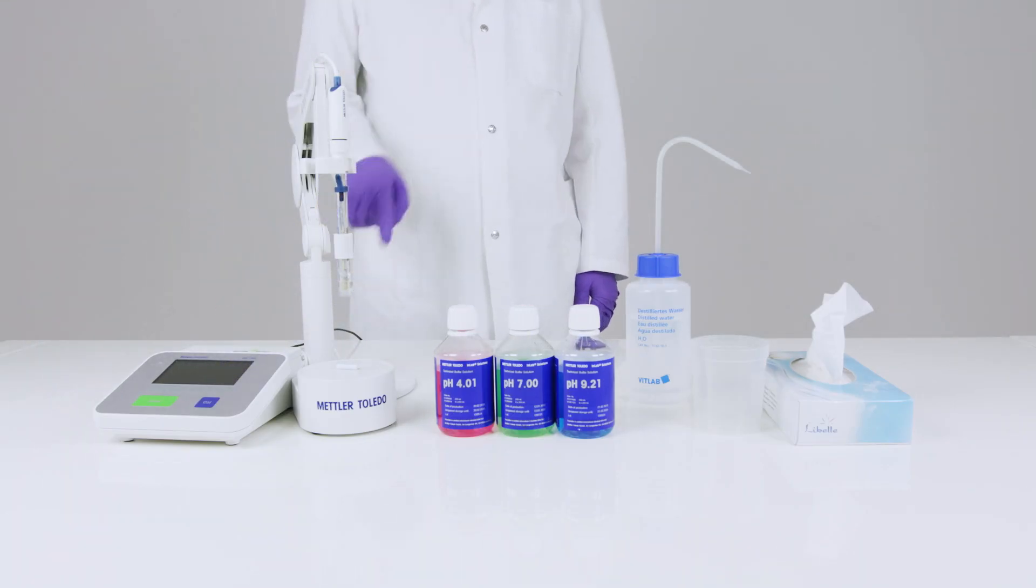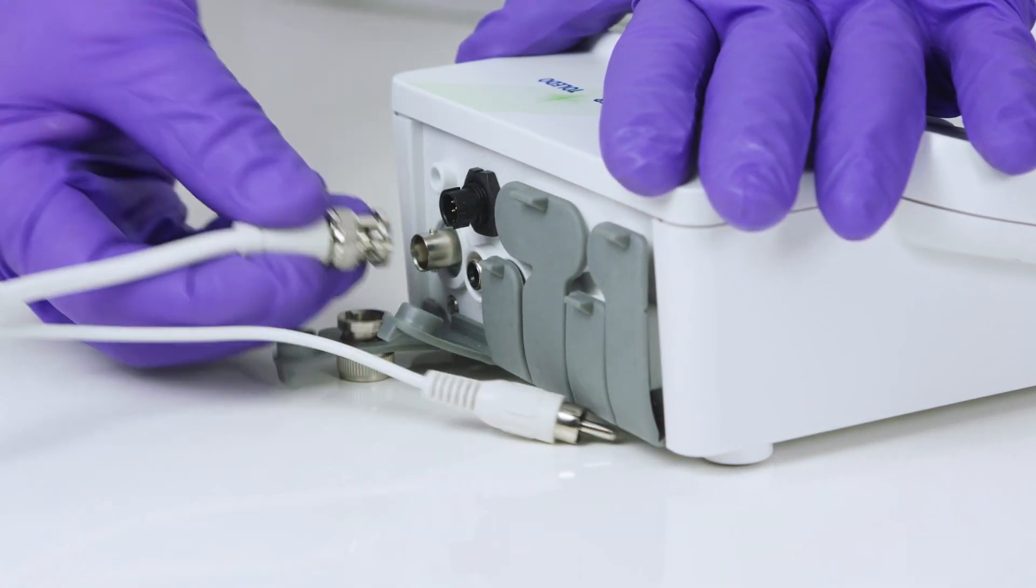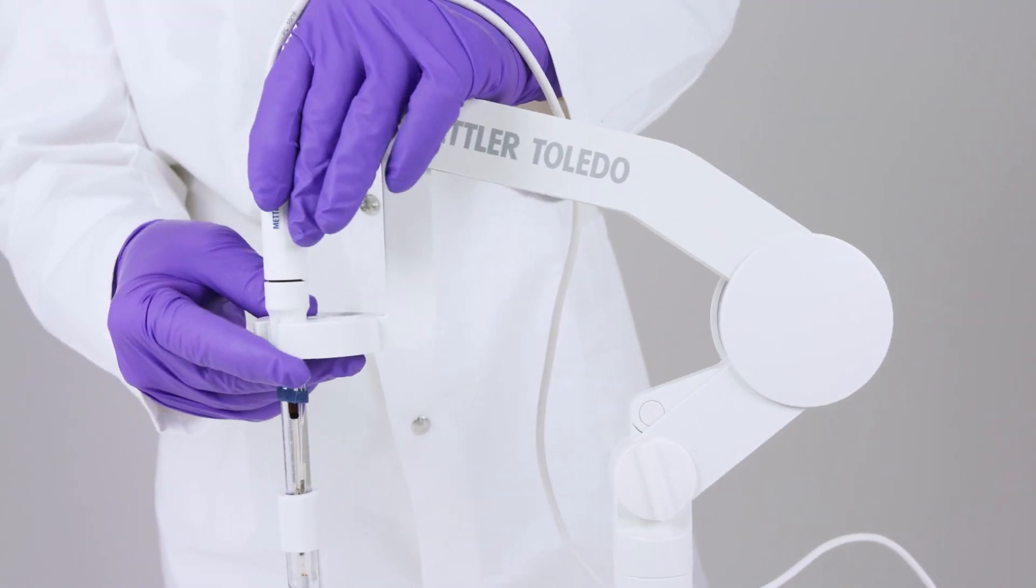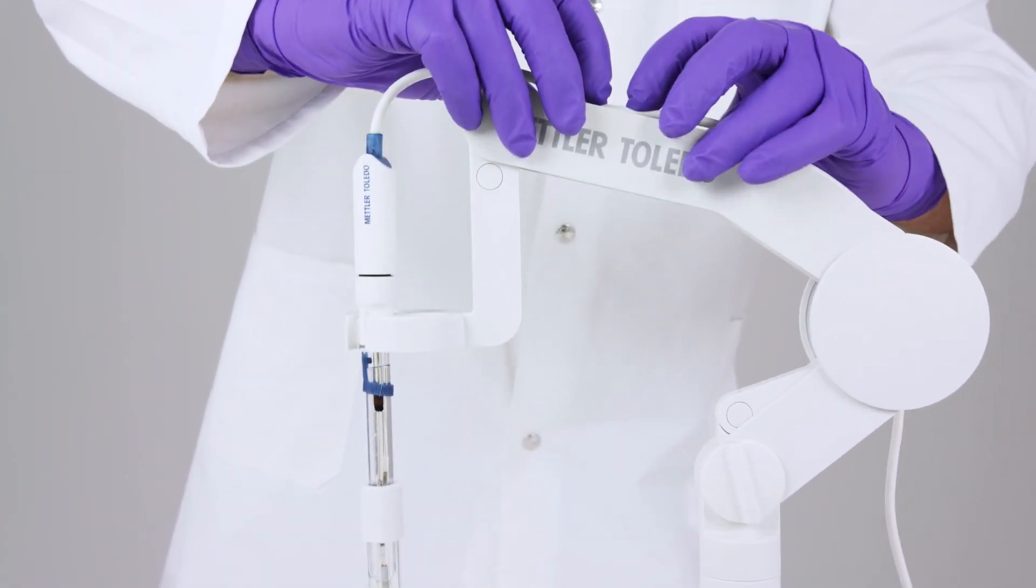You will need the meter, obviously, a sensor, a set of buffers, some distilled water, some lab-style tissues and, of course, a safe pair of hands. When you have everything you need, it's time to build the equipment. Plug in the sensor and its temperature probe if it has one, then place the sensor in the U-place holder. Neatly, Hans! There's a reason for the cable tidy channel.